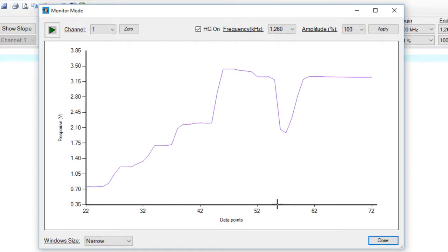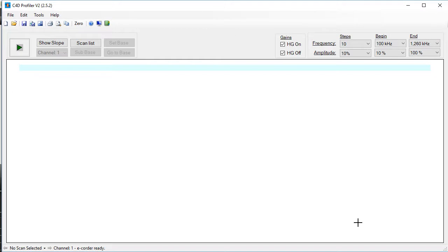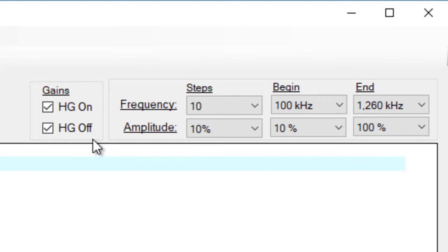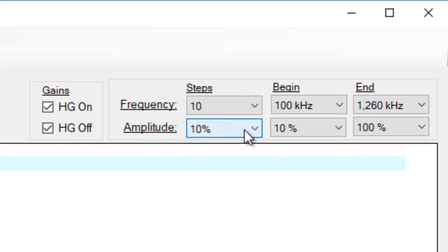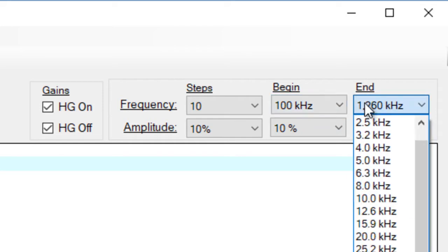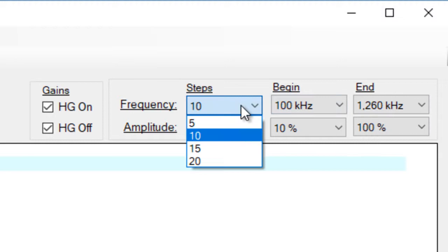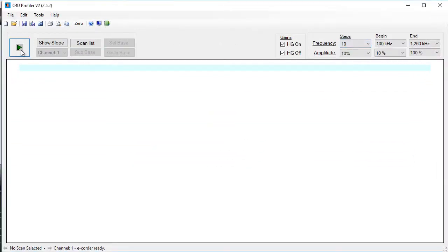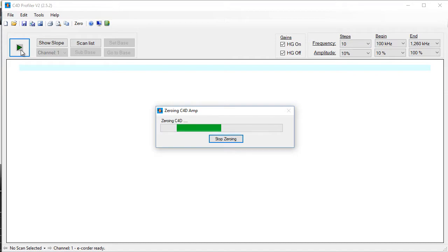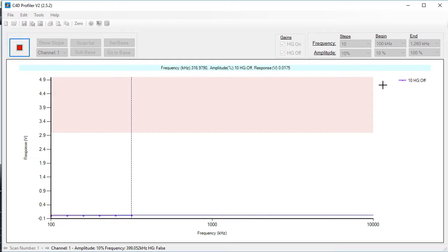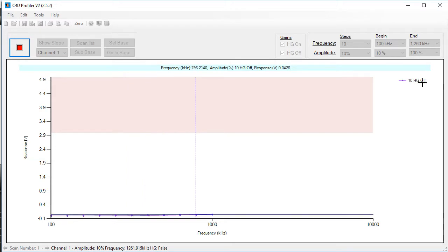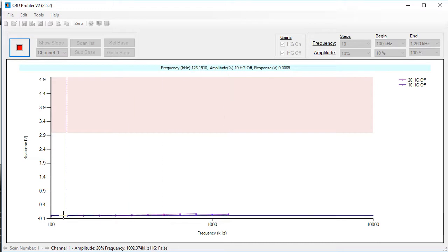We can now click Stop and Close. We're now ready to set up our settings for the C4D profiler. For the head stage gain, we're going to run with both the head stage gain on and off. For the amplitude, we're going to start at 10%, go up to 100% with 10% steps. For the frequency, we're going to start at 100 kHz, go up to 1260 kHz in 10 steps. You can now click the green arrow to start, and it's going to zero the signal. When it's finished zeroing, it's going to start the profiles — starting with 10% amplitude with the head stage gain off.